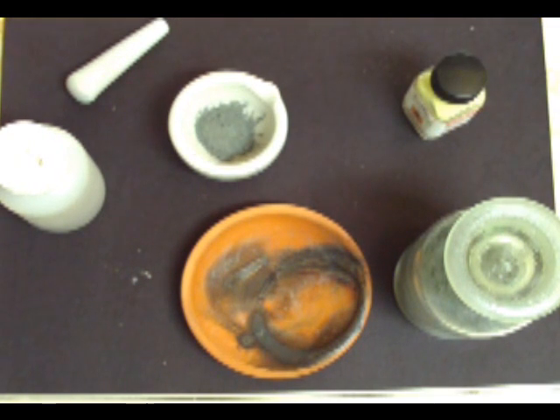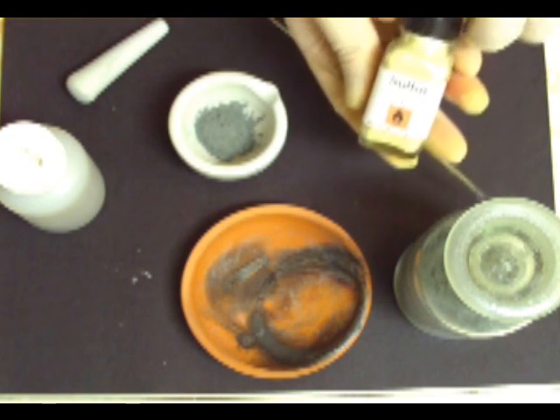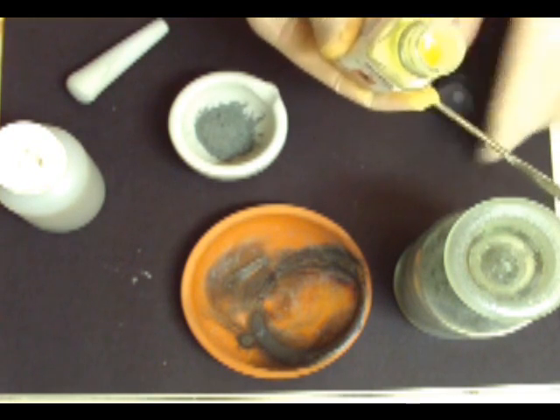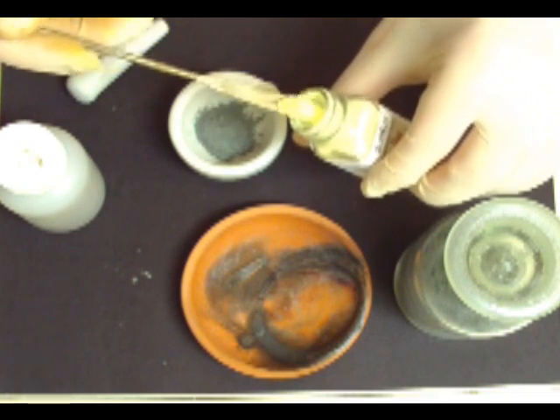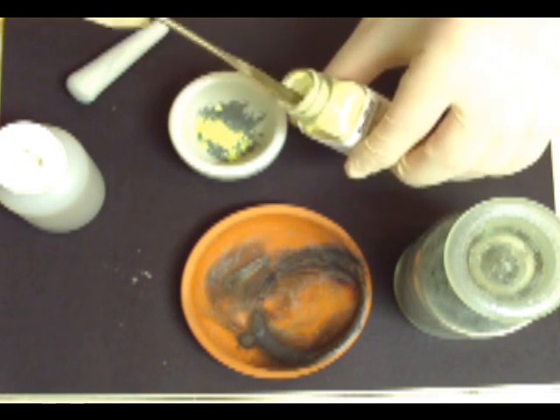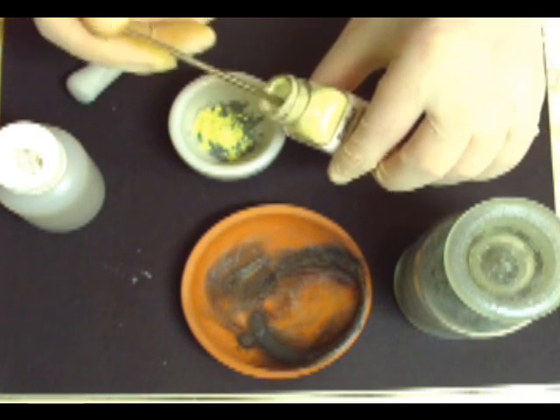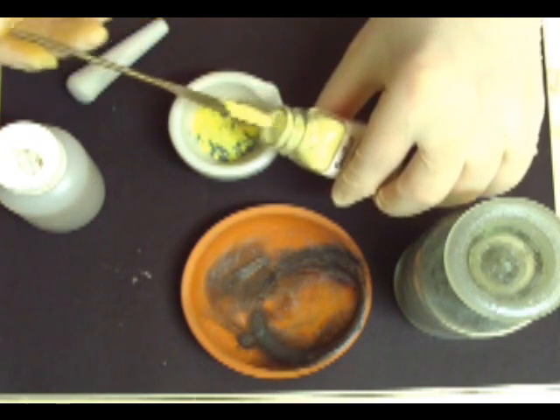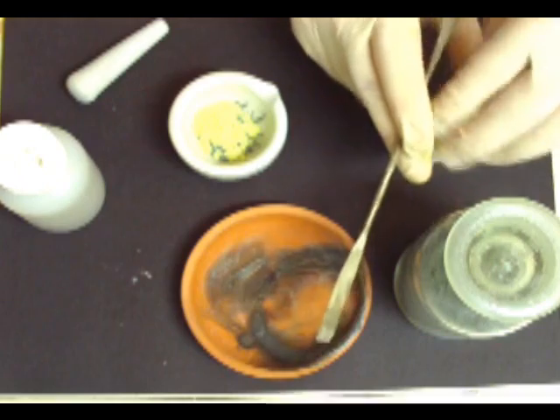So now we want to add 32.6 grams of sulfur. I haven't tried this with cheap sulfur — you can buy it at Walmart, flowers of sulfur, or anything like that. I've always just used sulfur that I bought as a reagent, but I think the other will work fine if you want to give it a try.